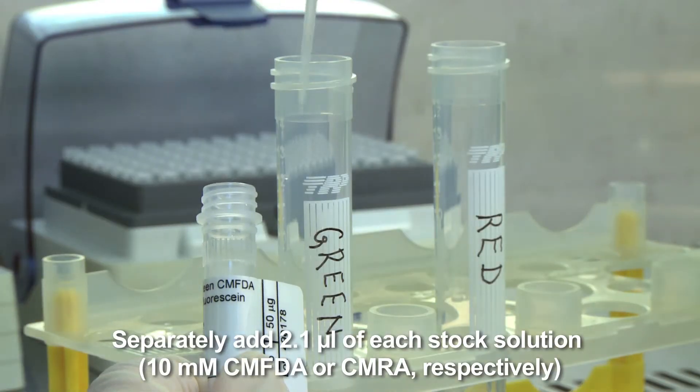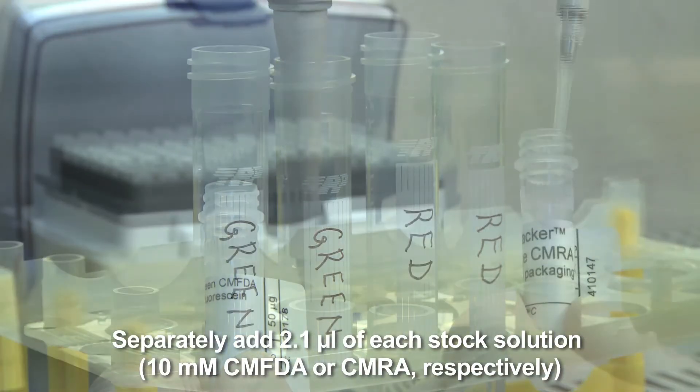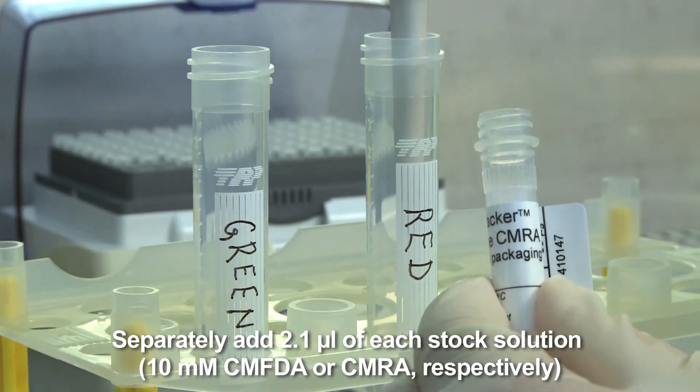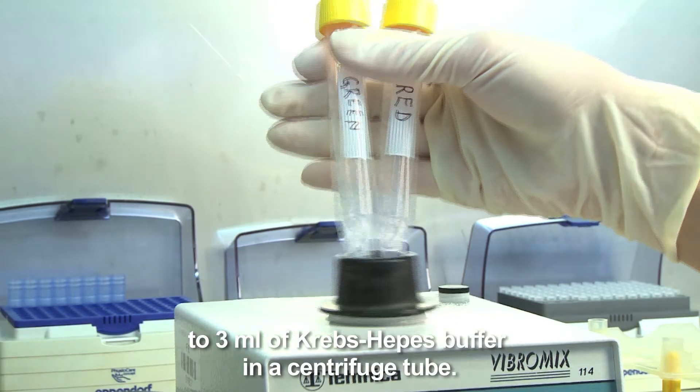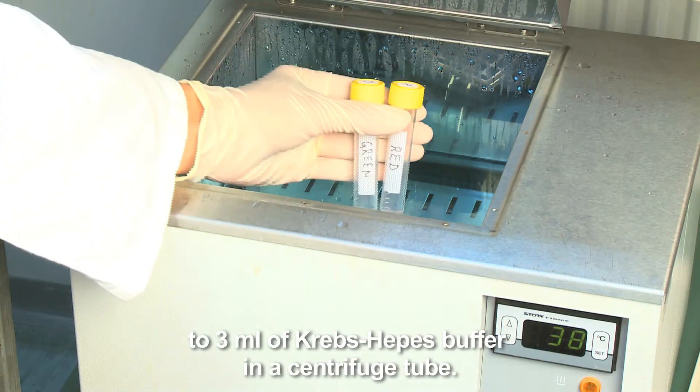Separately add 2.1 microliters of each stock solution, 10 millimolar CMFDA or CMRA respectively, to 3 milliliters of Krebs-Hepes buffer in a centrifuge tube.